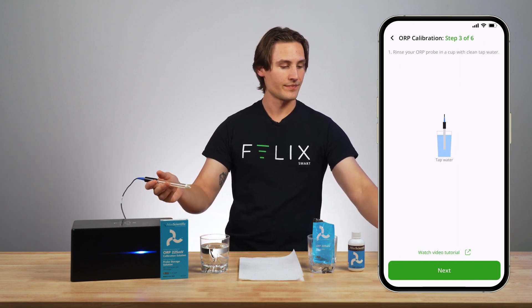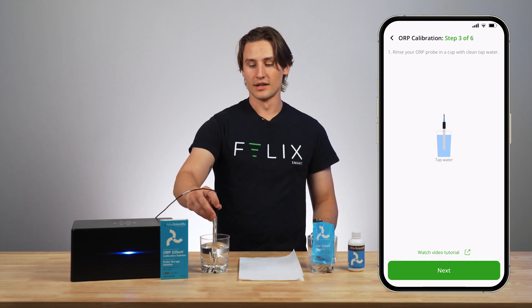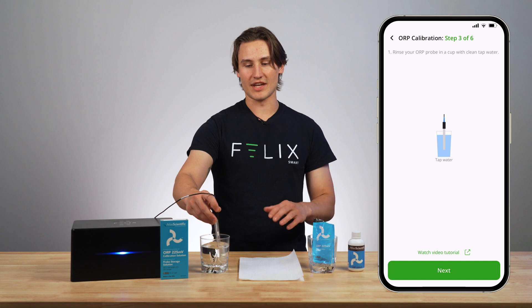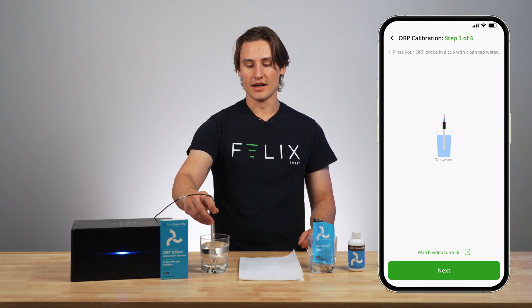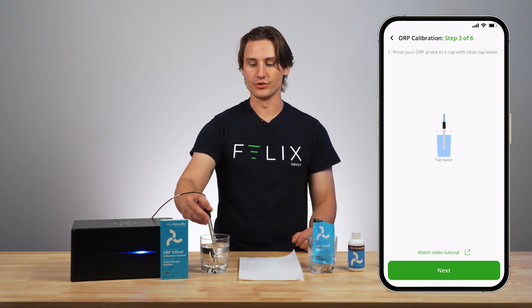Now I can click next and I will want to rinse my ORP probe in this cup of water. So you're going to want to have a clean cup of tap water handy for this. I have an extra glass right here just to hold up my calibration solution.